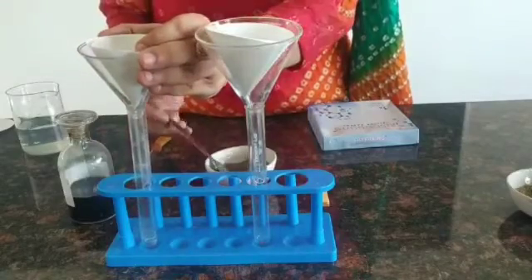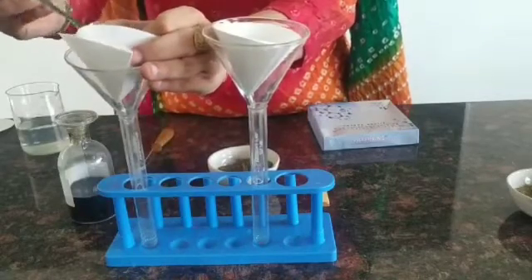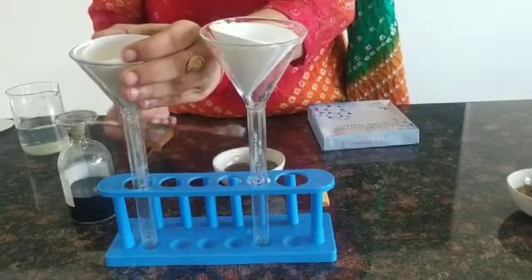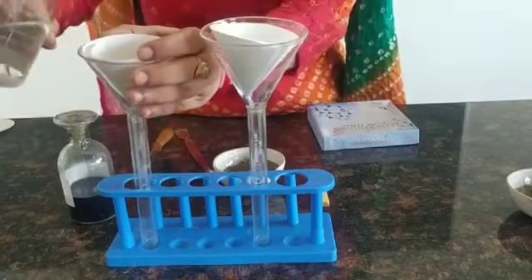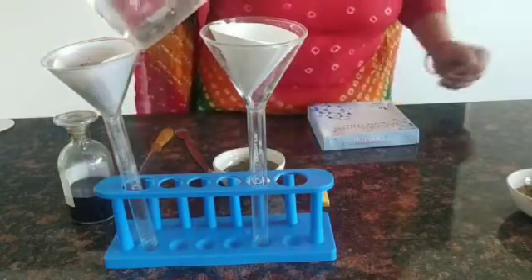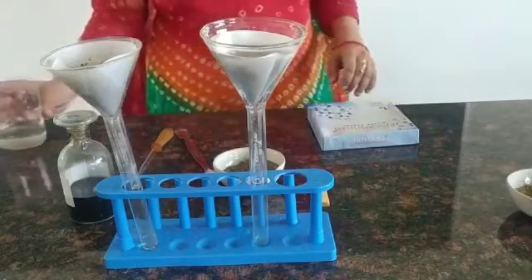Now we'll add water so that it percolates down through the soil. We'll collect the water in the test tube. When the water drips down through the funnel, it is collected in the test tube, which will be used for testing the pH. Let the water drip down slowly.